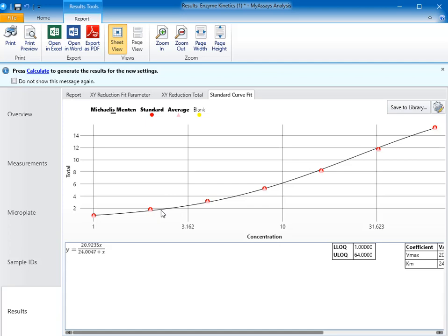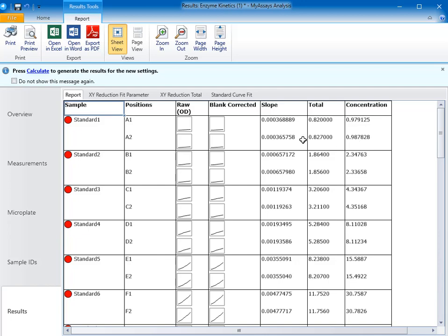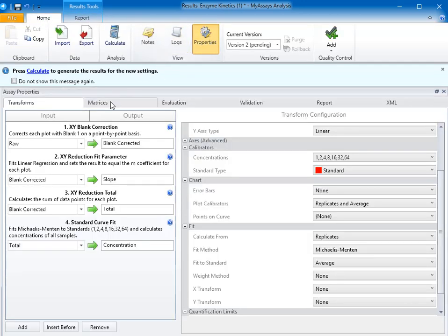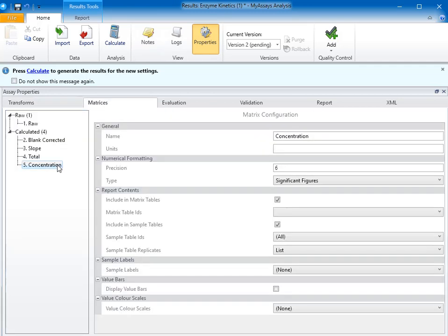I'd like to make a couple of changes to simplify the information appearing on my report tab. In my sample table, I don't want to see the concentration column. In my assay, the slope corresponds to the initial rate of reaction, and the total column can be used in a separate equation to approximate bioavailability. The concentration column is unnecessary because I'm using the Michaelis-Menton fit to calculate the Km and Vmax, not necessarily to obtain concentration results. To make that change, I'll again open the properties control, click on matrices, and under the concentration matrix, I'll deselect include in sample tables.